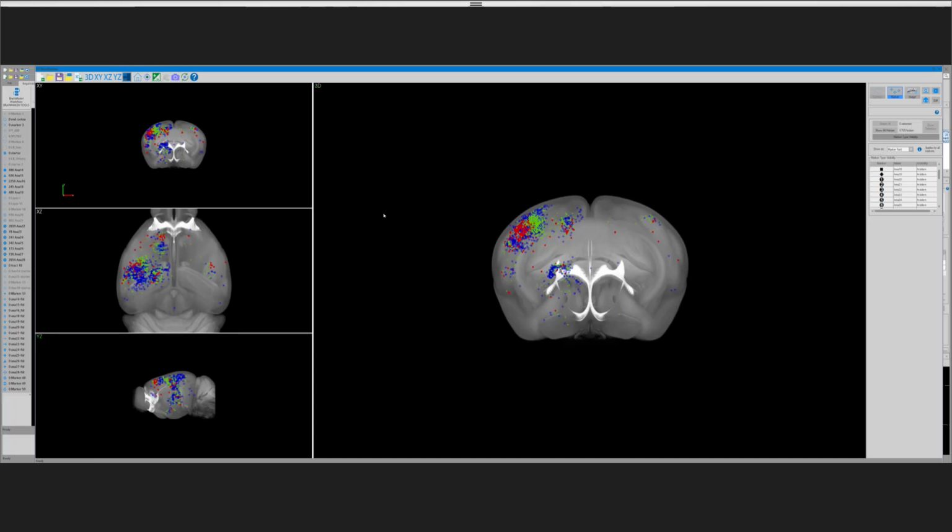I just want to start off with showing an example of a brain from an experiment. This is a pretty cool experiment that was done by Anna Lorenko Ignacio in Sian Lee's lab at IMH. What Anna did was inject 15 or 20 different mice with a single rabies injection into one neuron in the somatosensory cortex.